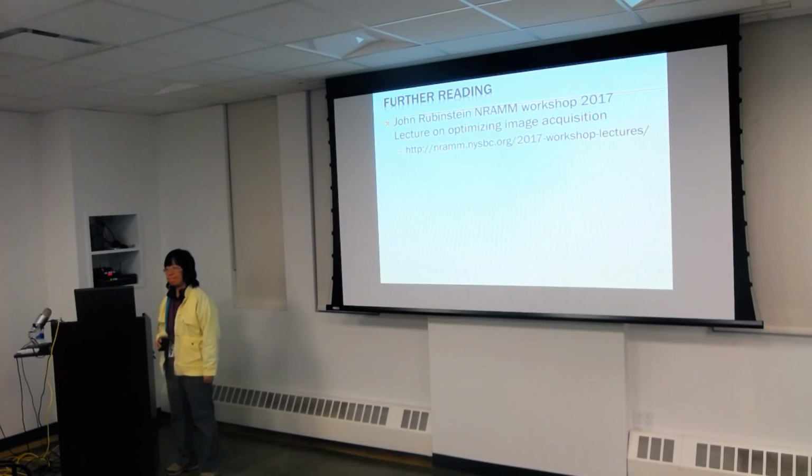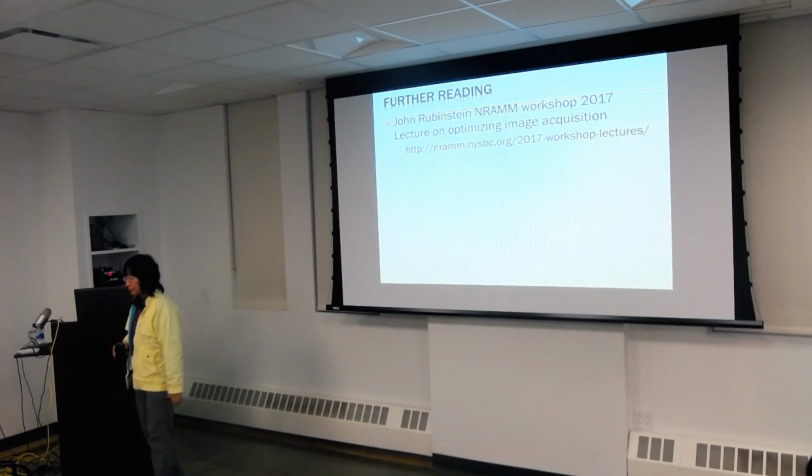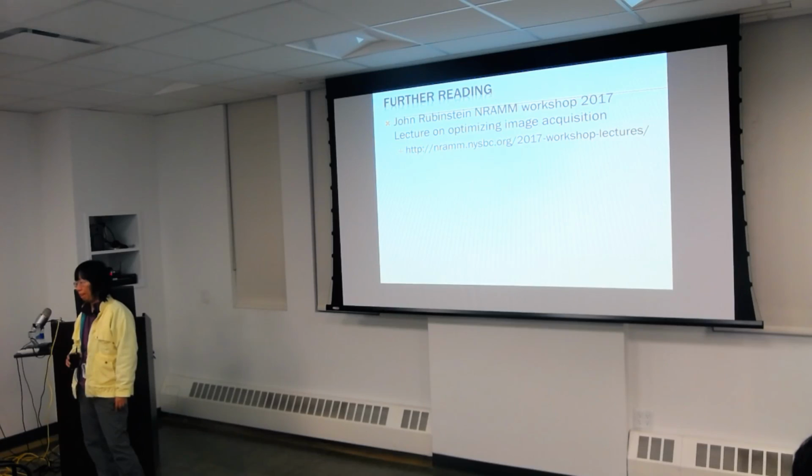All right. Well, actually, I had a question. Going back to Yangzi's discussion of focus versus defocus. In the beginning, the understanding is that a higher defocus leads to higher contrast. But then we talked about using focus and phase plates, and that also gives you higher contrast. Is there one that's preferable over the other, or where do you get the biggest contrast, basically?